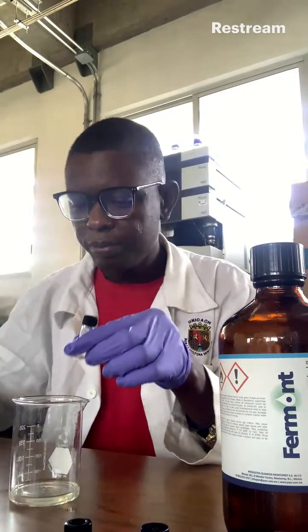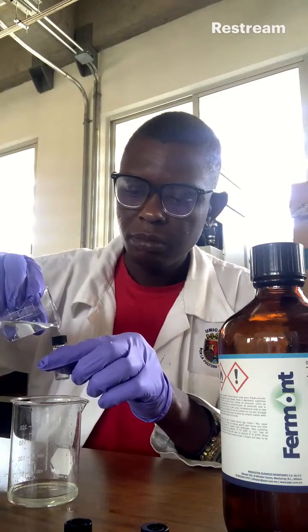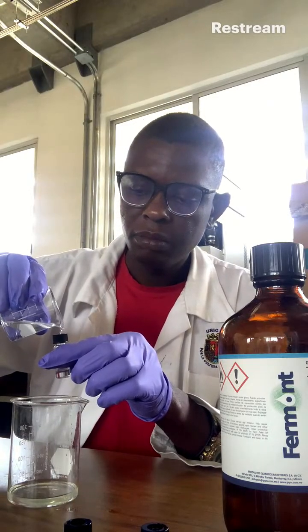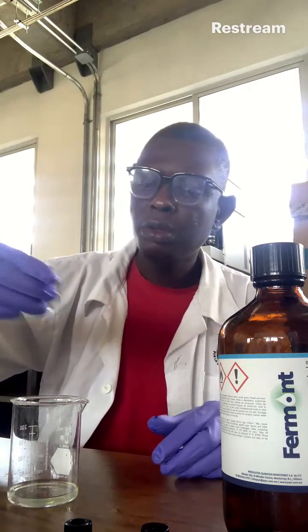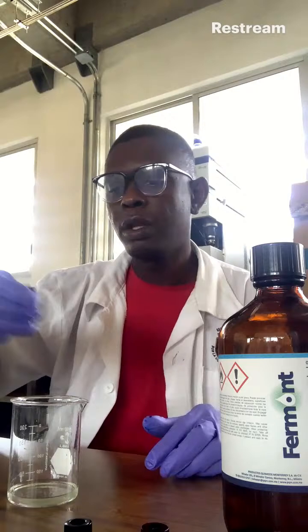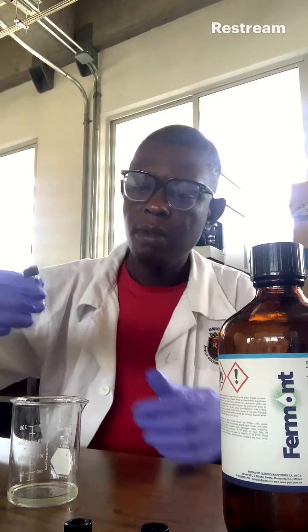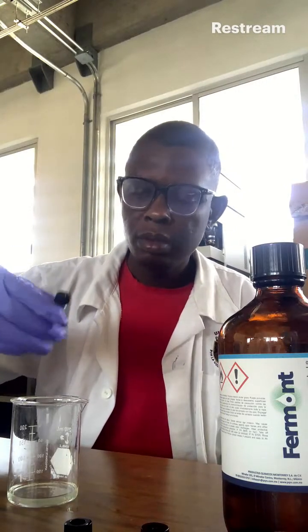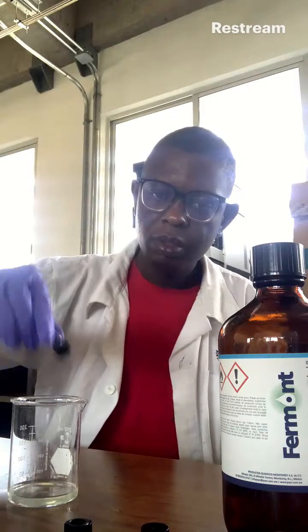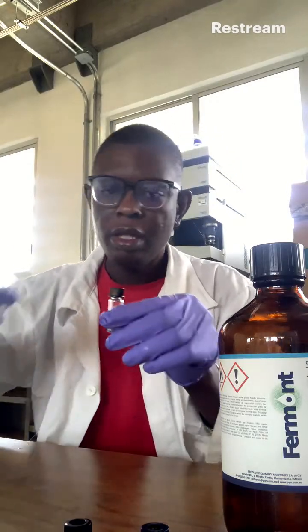The third one. I'll wash it also. And I'll fill it up.